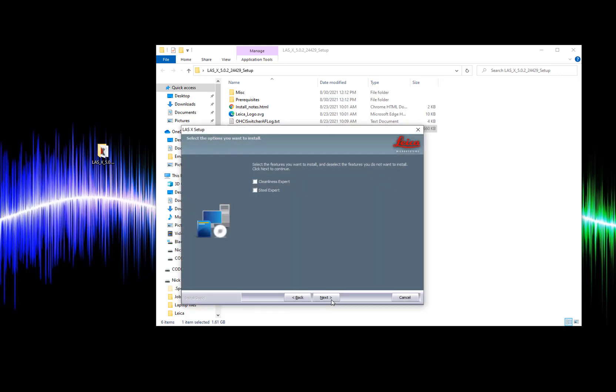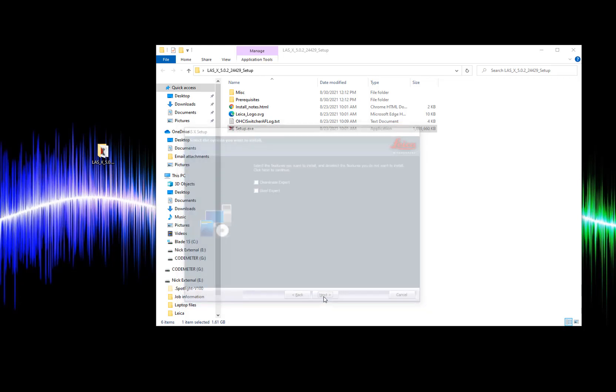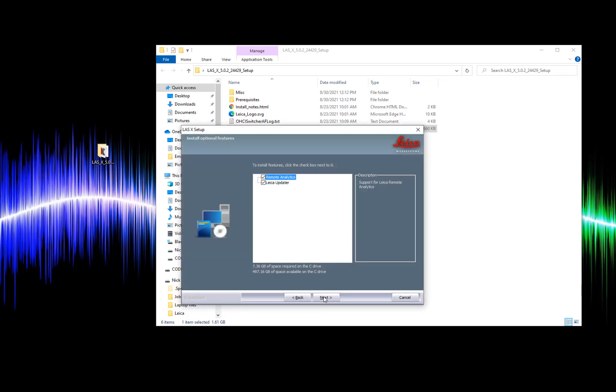Here we can check if we're installing Cleanliness Expert or Steel Expert softwares. In this case I will leave them unchecked. We want to keep both of these boxes checked for the remote analytics and Leica updater.